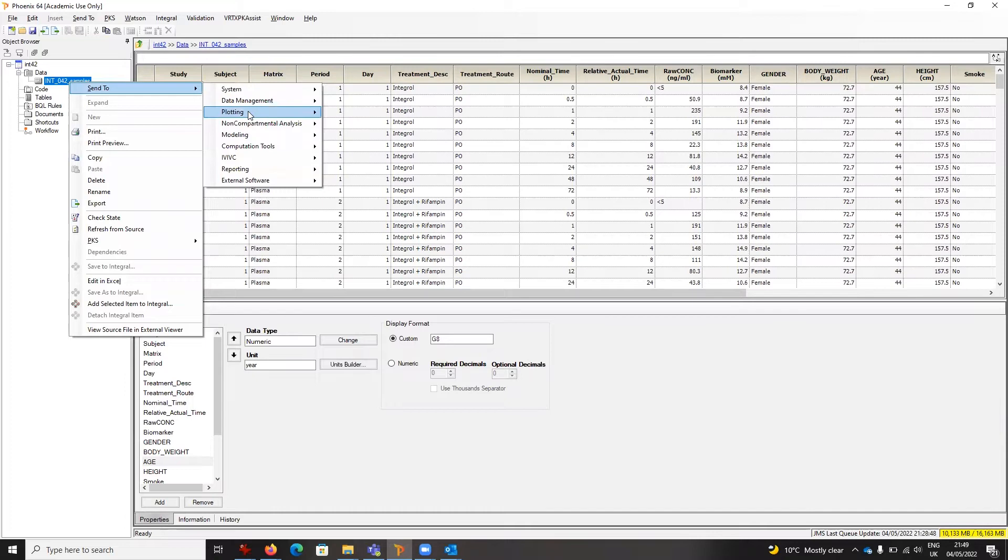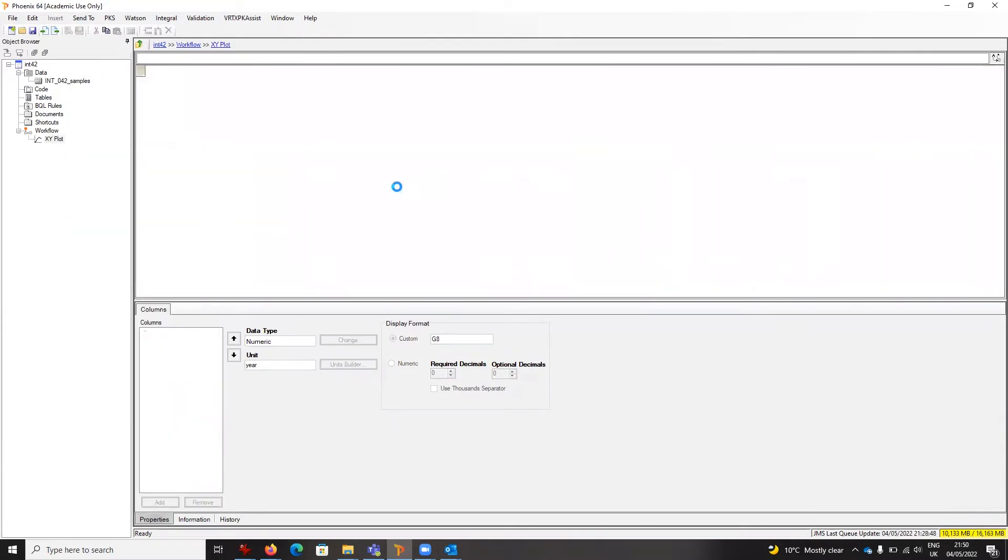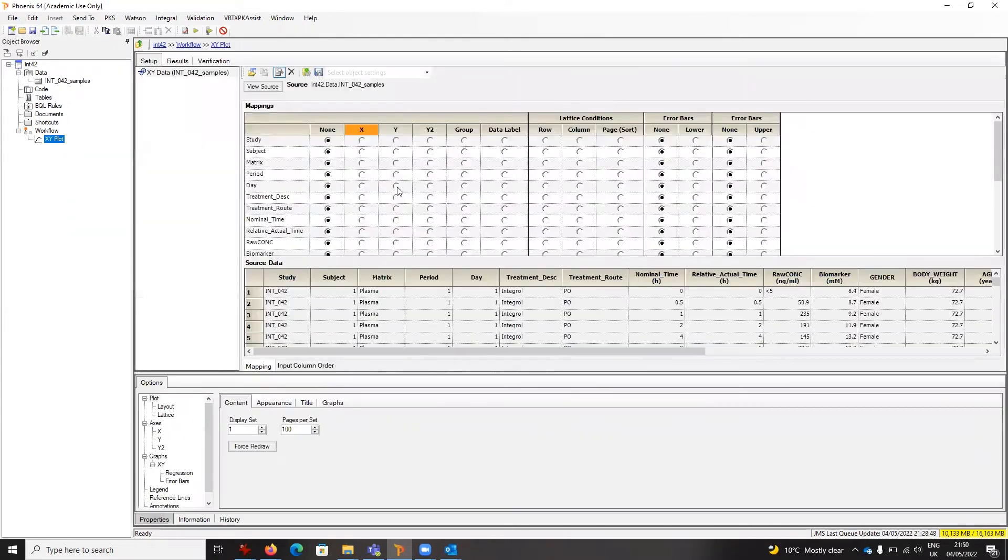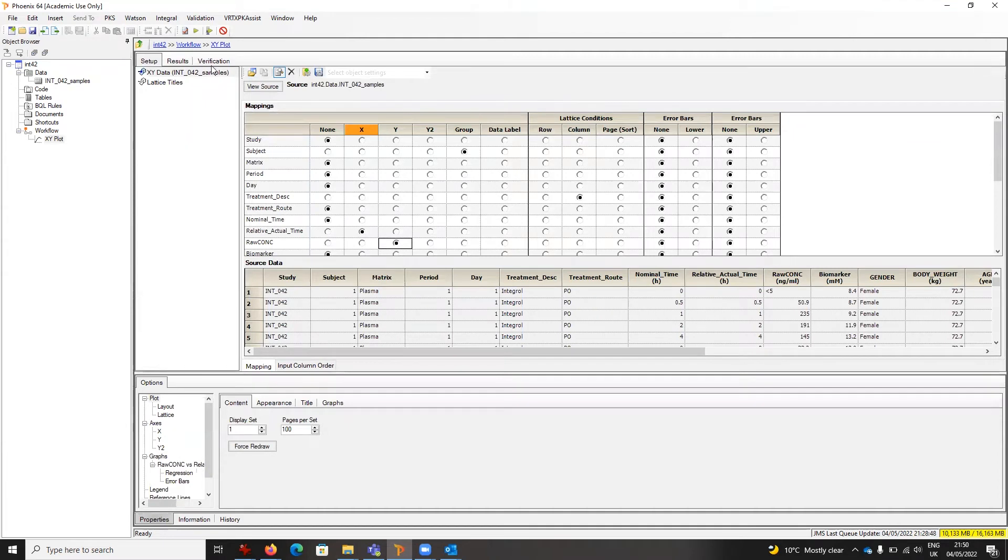I'm going to choose XY plot, then set the subject as my group, treatment description, make the lattice condition by column, and we'll have relative actual time for X and raw concentration for Y. Executing that, I'll see the two plots side by side on a single page.